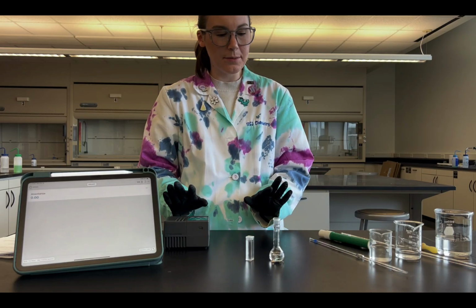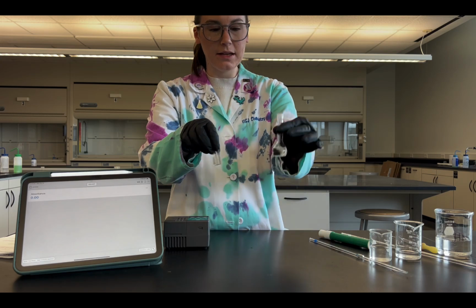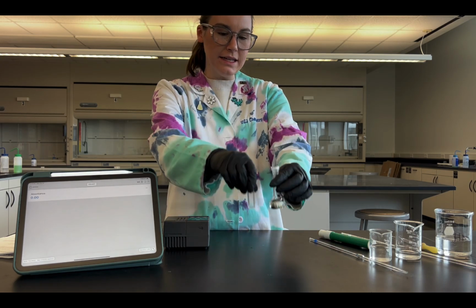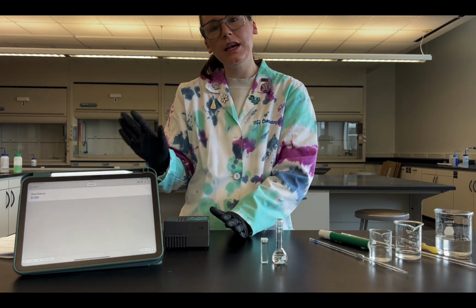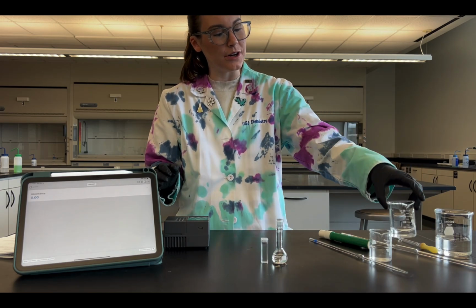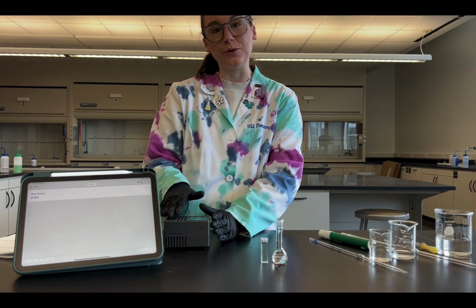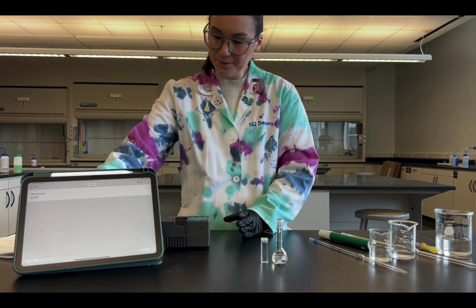I just took some time off camera to prepare my solutions. So I put my solution 6, or test tube 6, into this cuvette so that we can read the absorbance. What I also did was blank out this solution. Because my iron nitrate solution is now clear, whereas in the first one it was yellow, I do have to create a new blank for this portion. So my blank is now just a clear solution.